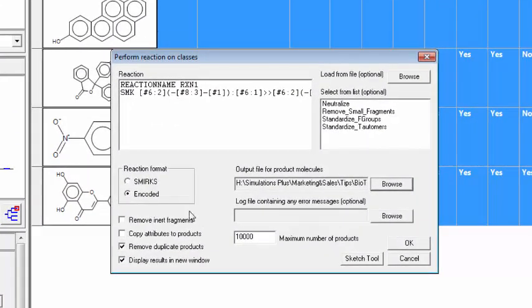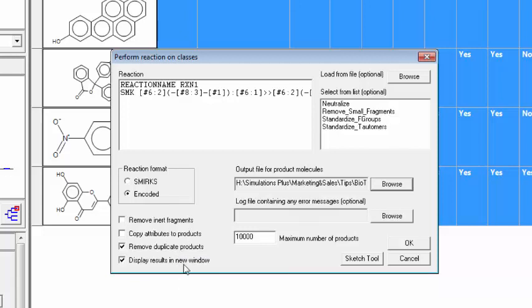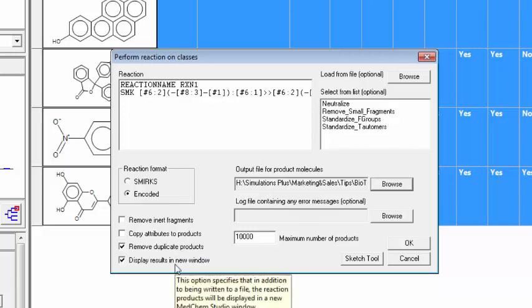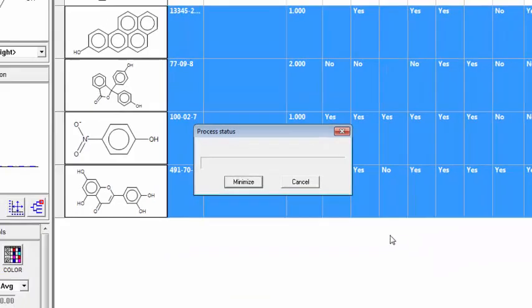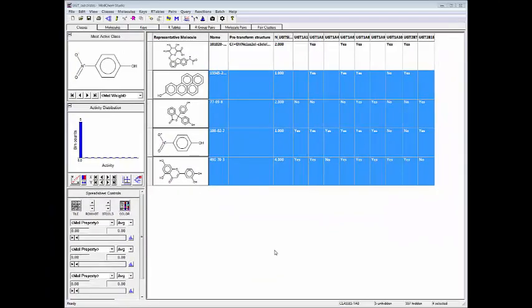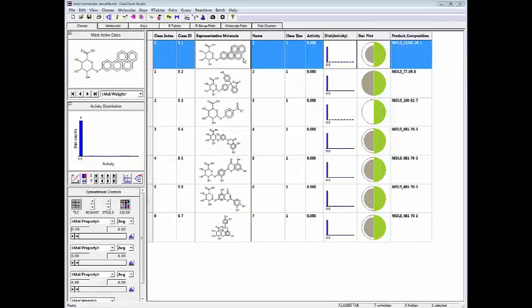The option here remove duplicate products will remove any products that produce the same glucuronidated result. And then I'll also display those in the new Medchem Studio window. So I click OK. It performs these transformations on these molecules. The transformed molecules are then displayed in a new Medchem Studio window.